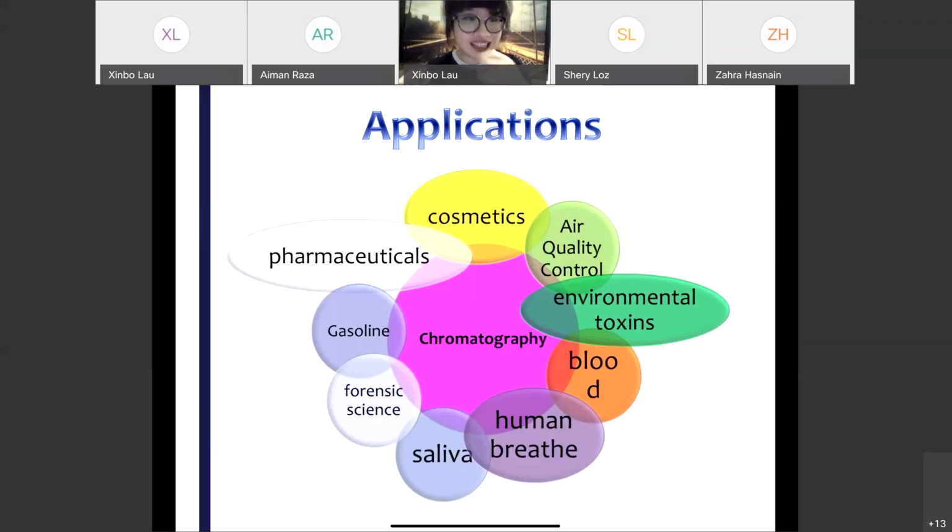And as I mentioned, if you like those criminal shows, I already mentioned this before. In the show, you see a huge box where they put the evidence in there, and after some time period they get the results back. Normally they mean gas chromatography. You can even study low concentration samples.